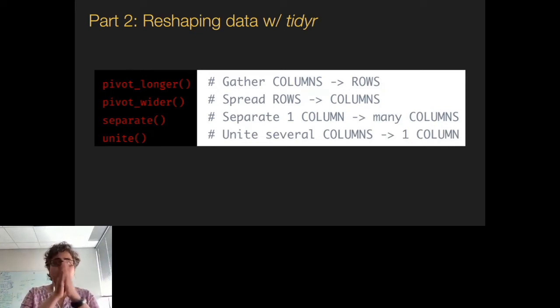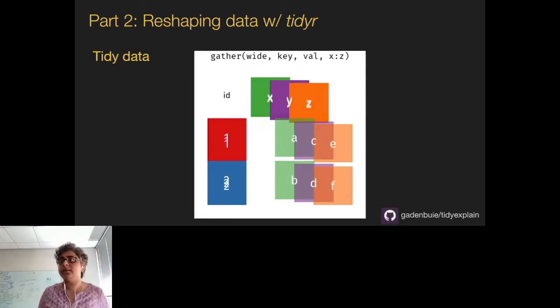I would say take this one column, find those hyphens, separate it by that, and give me 3 different columns instead. And now I can do the operations by year or by month. So that is when it becomes extremely powerful, using these simple one-line functions, separate and unite. I'll again demonstrate all of these to you, so it doesn't have to remain theoretical.